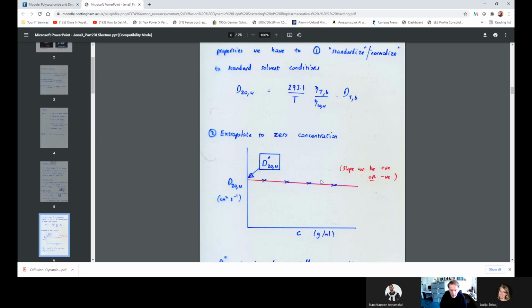And that's very important because, as I said at the beginning of the talk, one of the applications of dynamic light scattering is for looking at the behavior of high concentrations of monoclonal antibodies used in cancer therapies. So if at high concentrations the non-ideality effects are still small, that is a major advantage in terms of the interpretation of the data, in terms of conformations and association and interaction behavior. So that's an unexpected bonus of the dynamic light scattering technique. And I've given you the reference for this at the end of the notes.